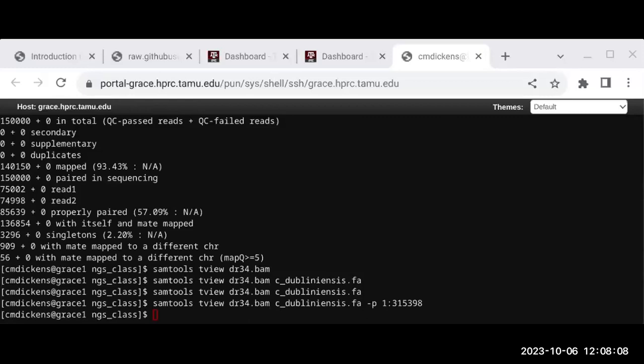You can do sequencing here, and then when you align it, you're going to see these peaks. So you hear a lot of peak calling when you're talking about ChIP-seq. That's what this is. This is a peak here. This is alignment depth, so these alignments of whatever you sequenced here are falling in this region here. And then you do that across your whole genome.